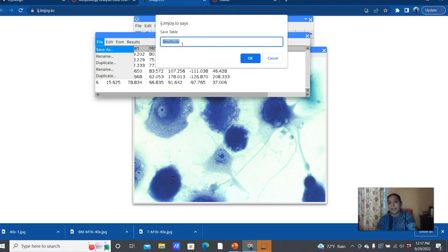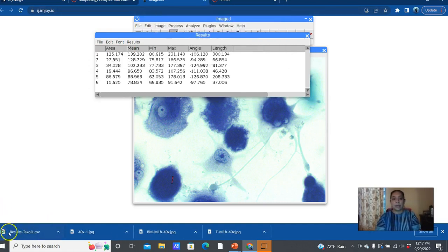And that's great, because then you can have all these numbers available in Excel as well. So you can say, sure, results for, and you would just label it with some number, as the name of the image, so that you know which results these are, right? And it's going to export them out to you as an Excel file.